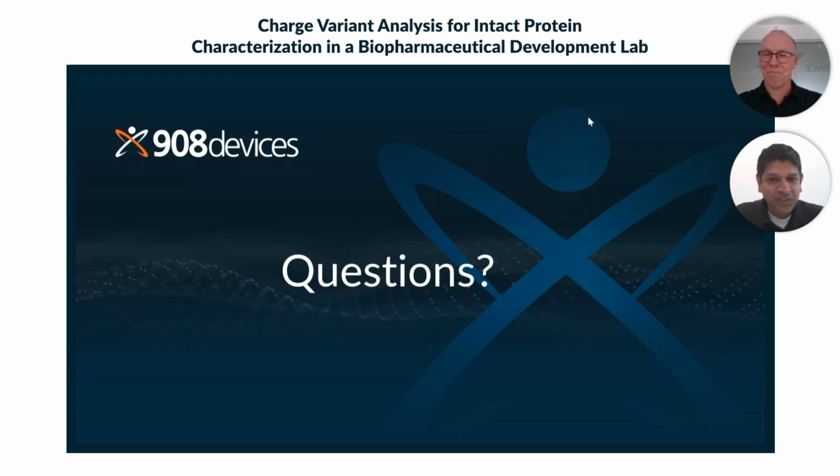But I think here's a question on the zip chip. Can the zip chip be used on other platforms other than Thermo? And the next question is, how does zip chip differ from traditional capillary electrophoresis? So I can take the first one, you can take the second one, if that's okay. I think you can take them both. All right. So can the zip chip be used on other platforms?